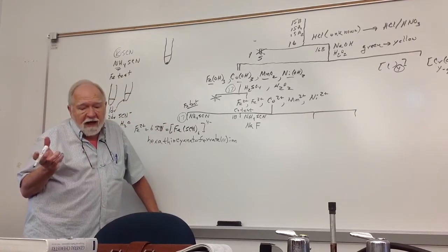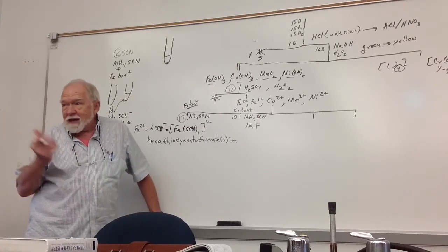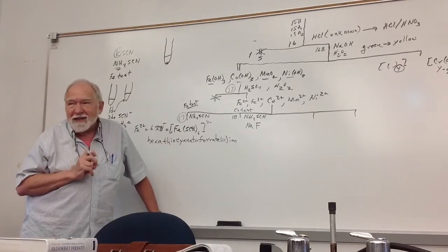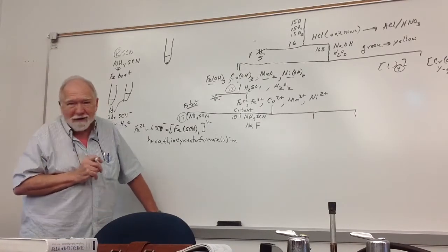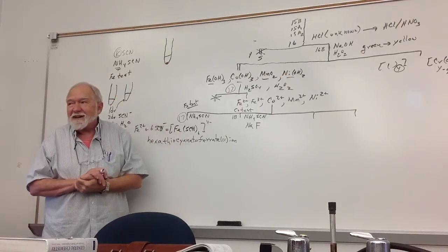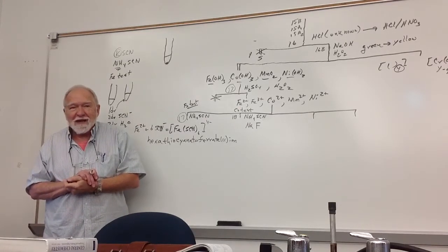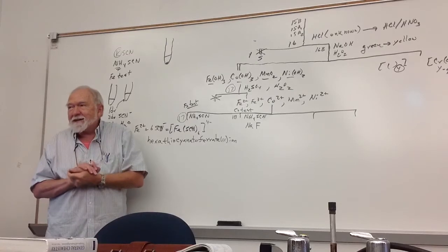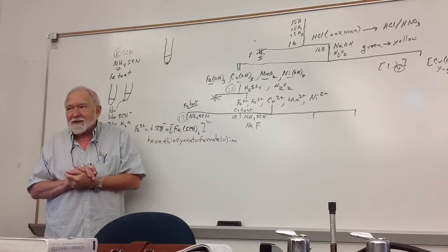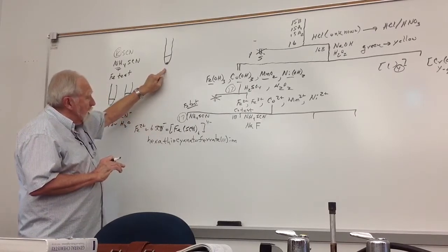Then the other thing that happens here, sodium fluoride etches glass. That's why we have so many counterbalance test tubes where the whole bottom of it is opaque, because people put a ton of sodium fluoride in there, and as it stands around, it etches the glass, and now you have to buy a test tube. So when you're doing that test, you might want to find one of my better looking old test tubes for the test. Okay. So first of all, you want to make a saturated solution of sodium fluoride.